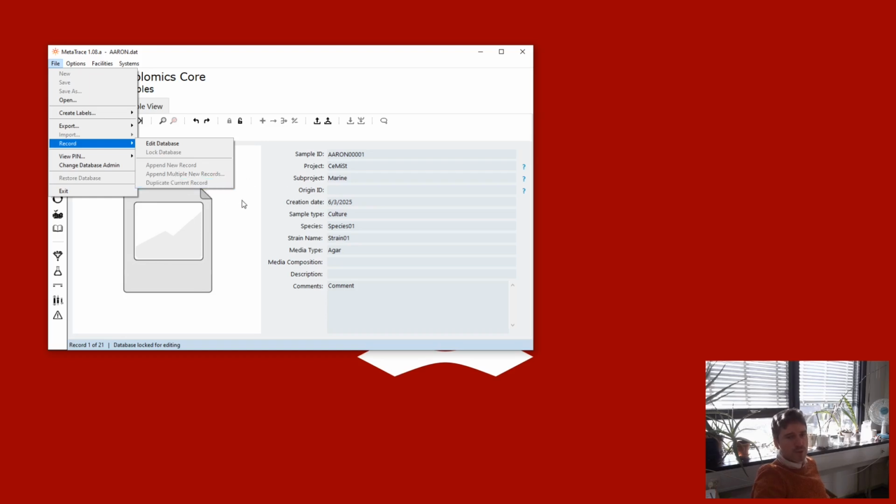Duplicate records, so that can actually be kind of useful if you've made a record and you just want to basically copy and paste that into a new record. Go to whatever record that is, click duplicate, or just copy and paste it basically. If you forget your pins, you can see them all in here. You can look at my database pins.